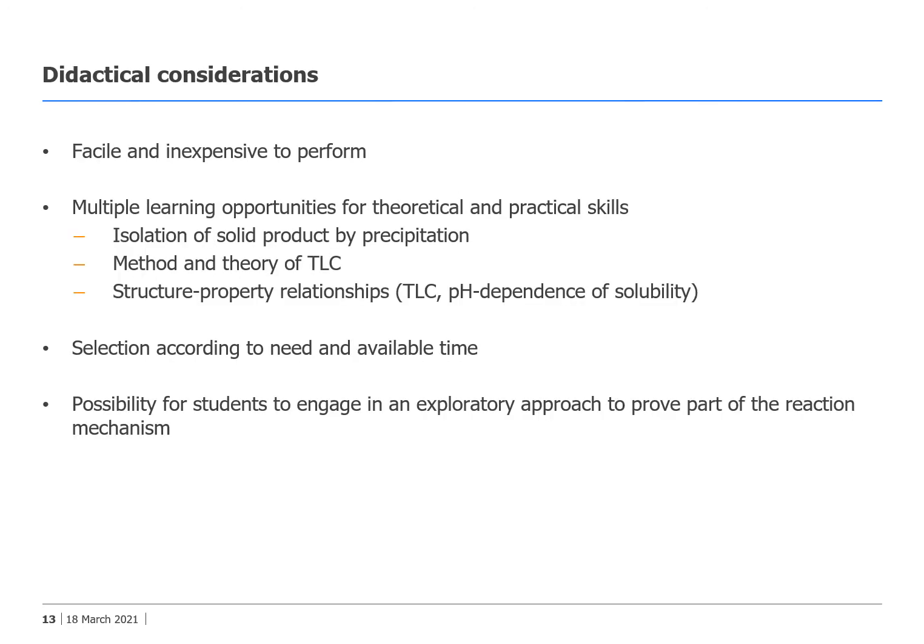Now that we have looked at the different experiments, what are the didactic possibilities and considerations? First of all, from a practical point of view, the experiments are facile and inexpensive to perform. The synthesis can be executed with common electrodes and comparatively low voltages in a simple beaker. Also, the TLC and filtration do not require any extraordinary equipment which should not already be available in the school.